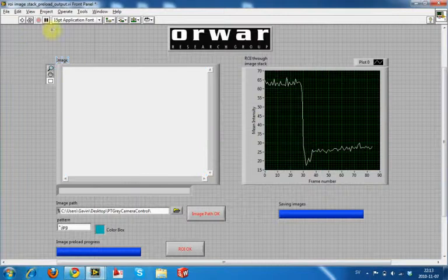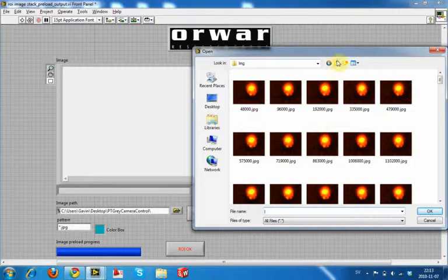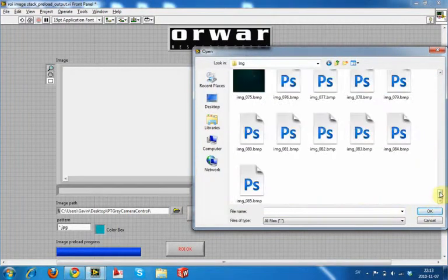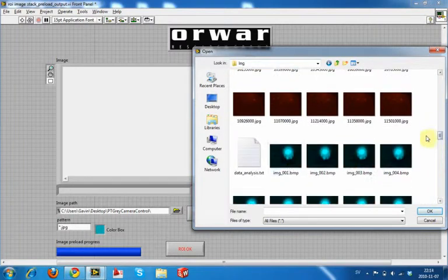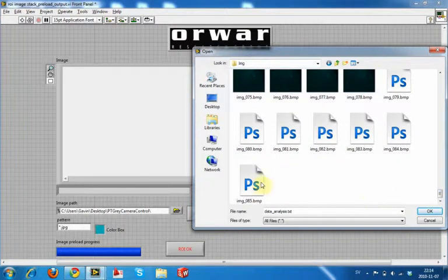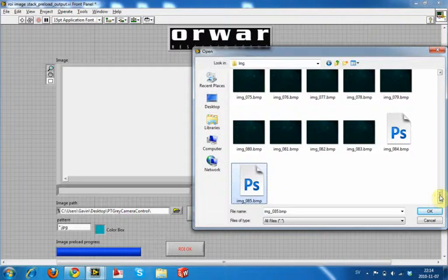So let's just go ahead and run it and see where we get. Okay, this is just another one of these great files by Celine. I mean, just delete all these ones. As you can see, these are ones I've done previously, and we have all these bluish images on the bottom. So we'll just go ahead and delete those because we don't need them.